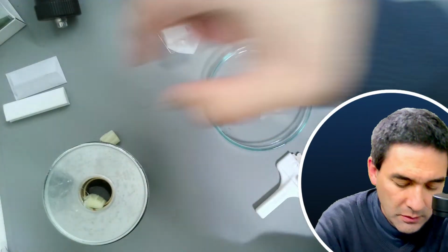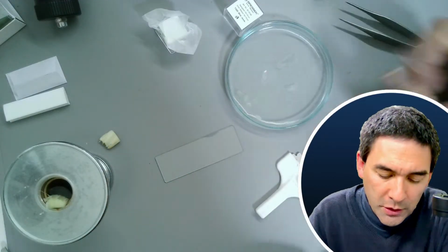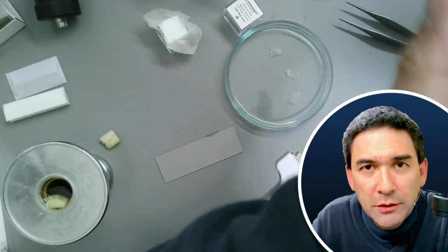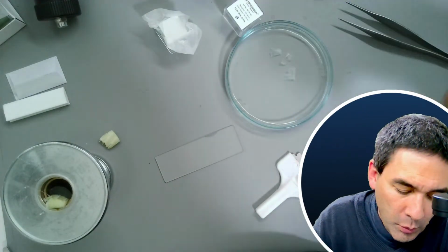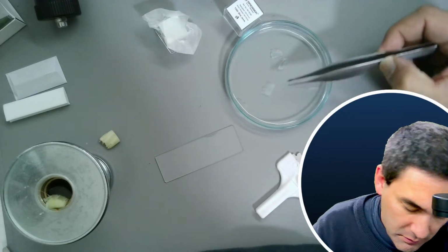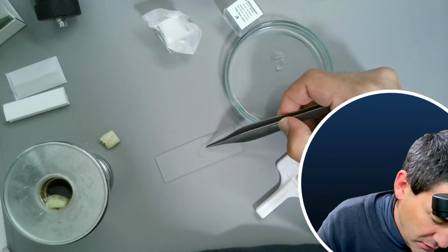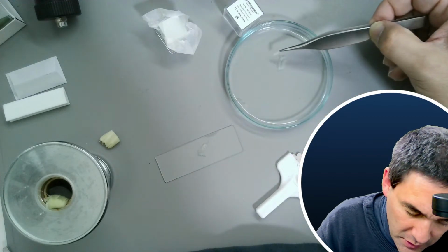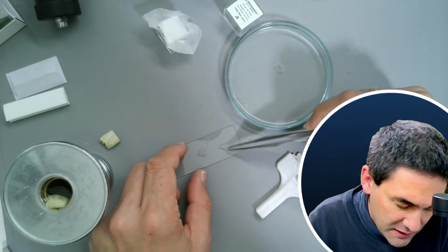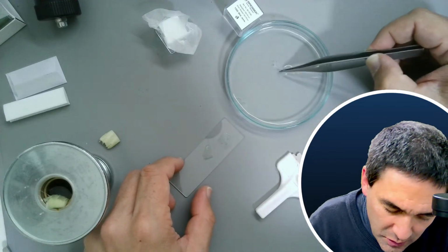I'm going to simply transfer. By the way, by putting it into water, some of the cell components, because some of the cells are going to be cut open, will be washed out, and sometimes this gives a nicer and cleaner specimen. So I'm going to put this on here. I'm going to try the other one here as well. It might be a little bit thinner, and I have to somehow spread this. This is actually thinner than the other one. The third one maybe as well.